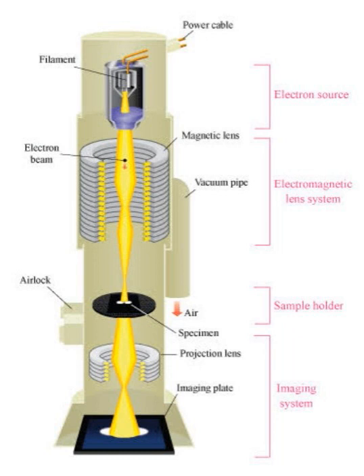In principle, viewing a specimen under a transmission electron microscope is similar to the observation of stained cells with the bright field microscope. The specimens are fixed and stained with salts of heavy metals which provide contrast by scattering electrons. A beam of electrons is then passed through the specimen and focused to form an image on a fluorescent screen.